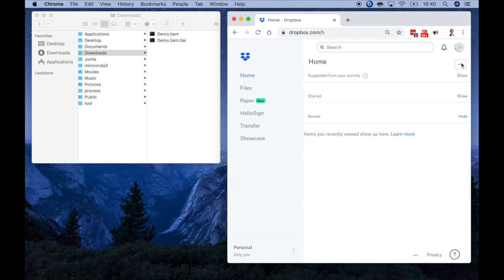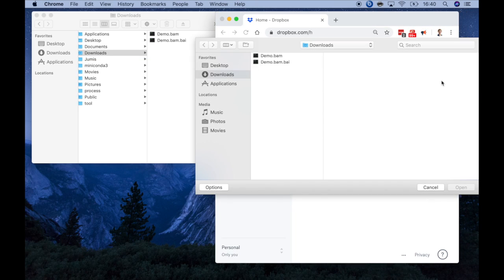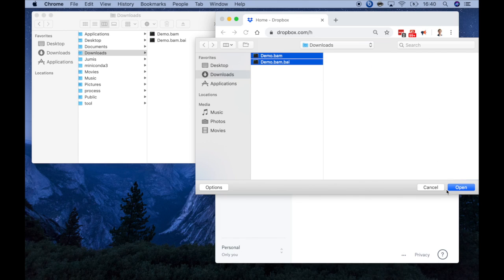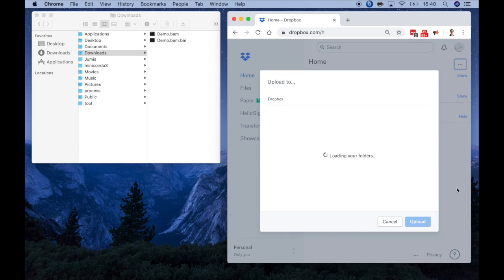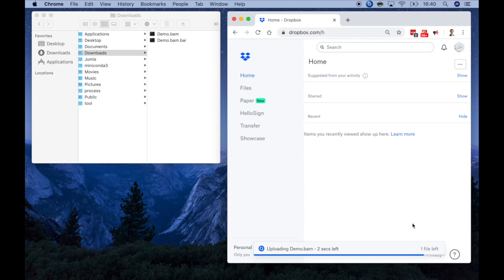By default, with an unpaid account, Dropbox files can be viewed by anyone with a file URL. Note that Dropbox URLs are quite obscure, making it unlikely that someone will find the data without the URL.